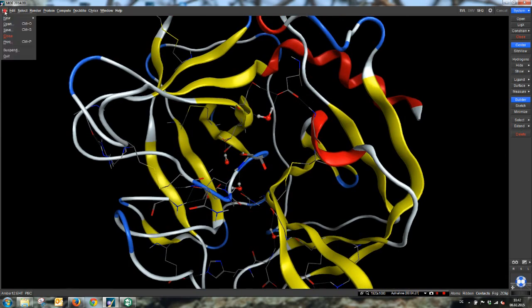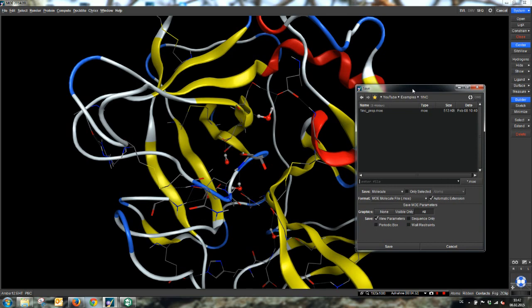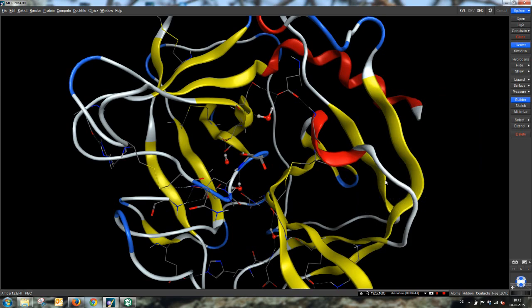And this receptor file with the nucleophilic atom named Cap and the deleted ligand is named COFRAC prep MOE. This is the default, but of course you can assign your own name, that's no problem. But when you use the default, then it is pre-typed in every graphical user interface of the DOCKTITE workflow. Okay, this is the first file.